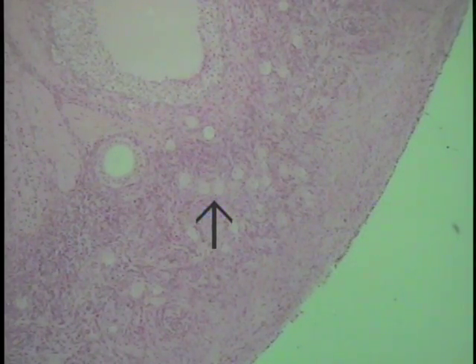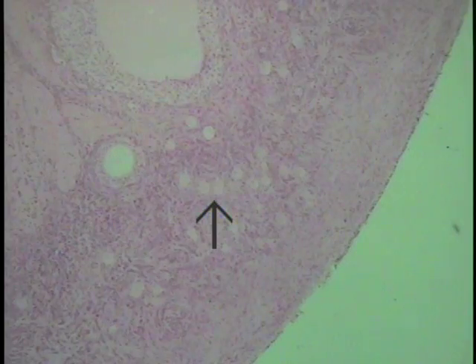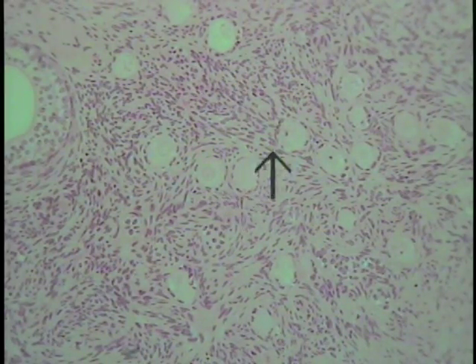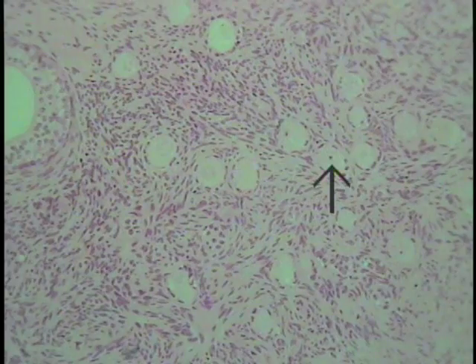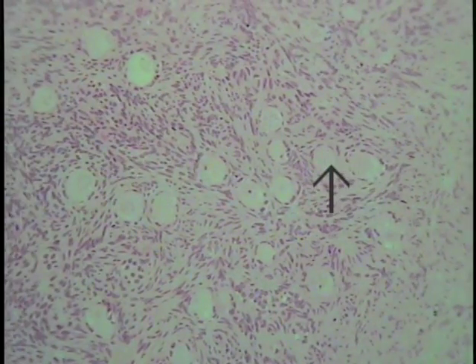Go down and examine these particular large cells in detail at higher magnification. These large spherical structures here are individual cells, one being located at the tip of the pointer, another located here, another here, another there, and so on. So these are extraordinarily large cells — clearly identify in your own mind what these structures are.